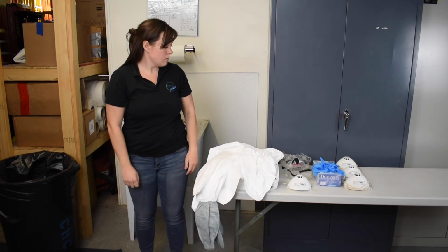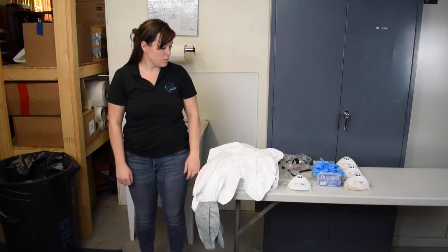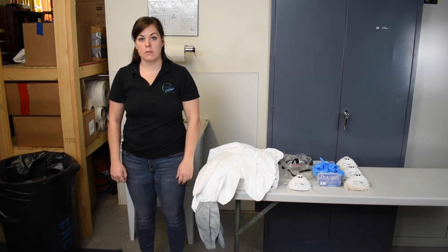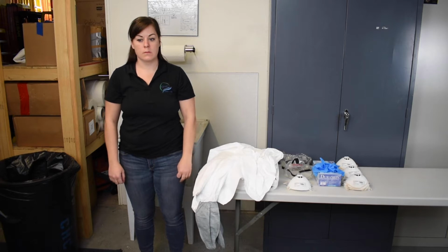The PPE shown here is recommended by the CDC. If used correctly, this PPE is designed to eliminate physical gaps in coverage. Namely, no skin or hair will be showing.